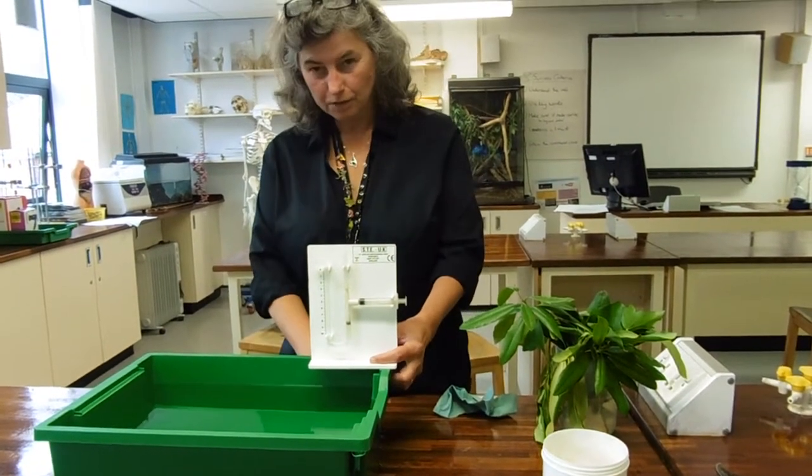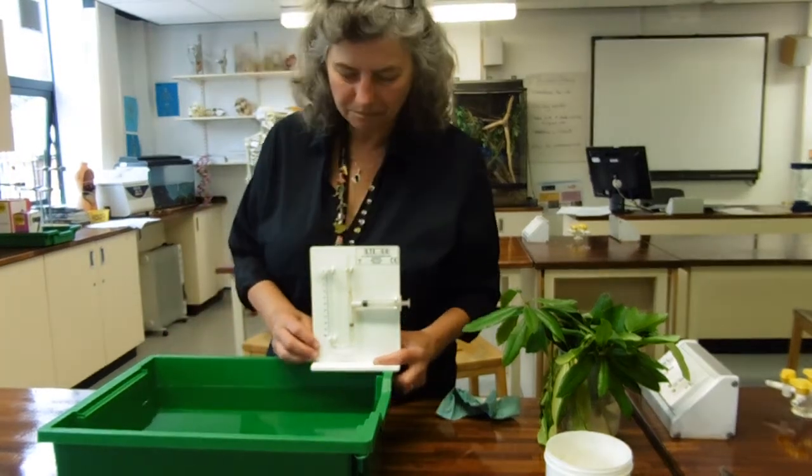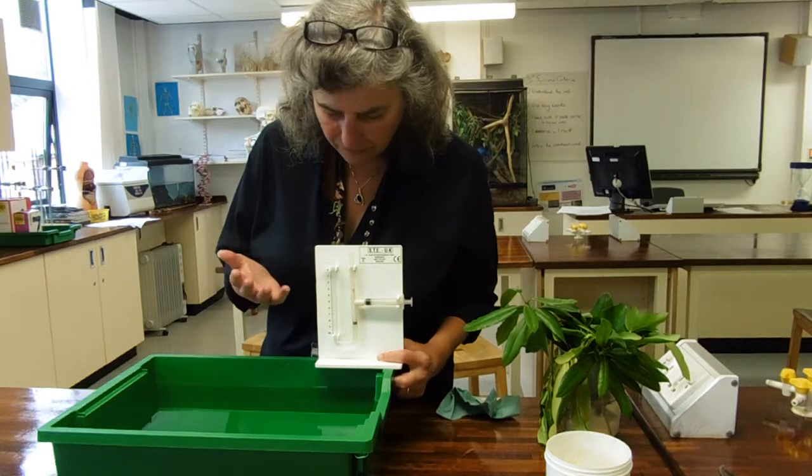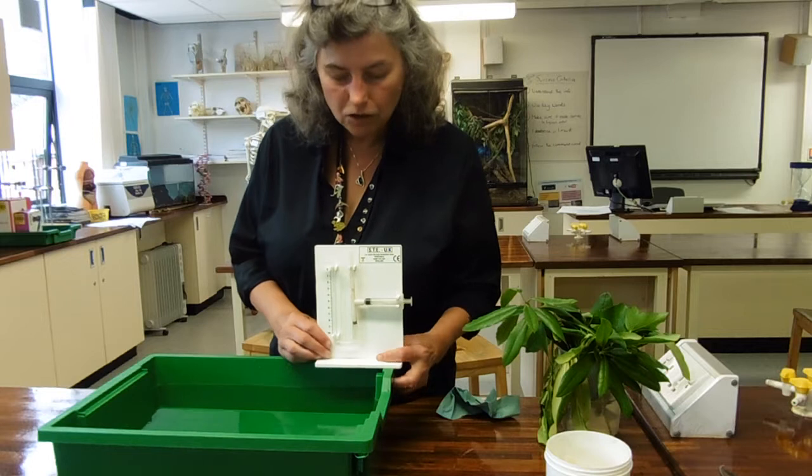So this is a photometer, which is the practical in your practical book. They do vary in design, but they all have the sort of following features.